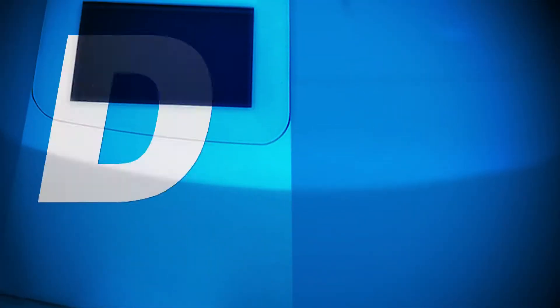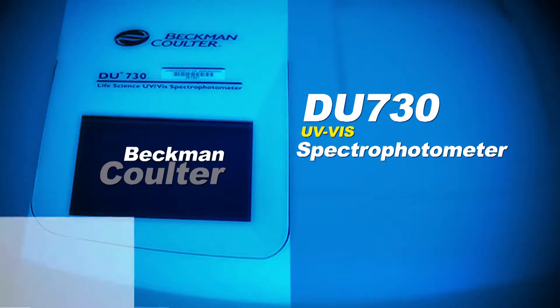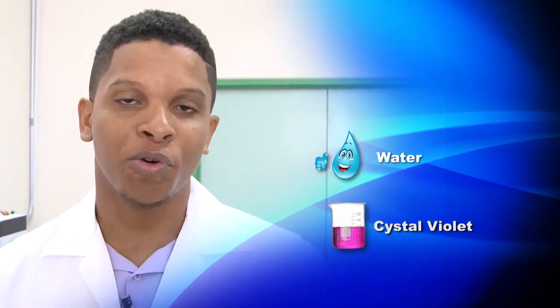Hi, my name is Kirk Mears. I'm a senior labor technician at the University of the West Indies K-field campus. Today's video will show you how to correctly use the DU730 UV-Vis spectrophotometer by Beckman Coulter. You will go through a simple experiment using water as our solvent and a solution of crystal violet.